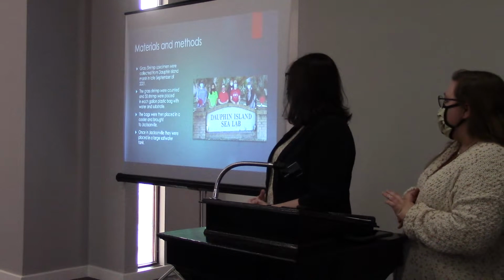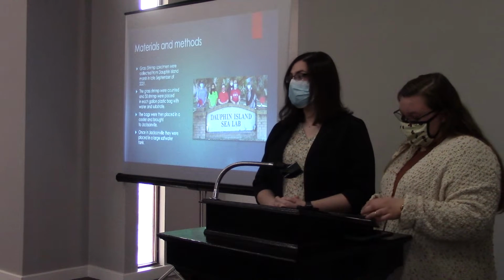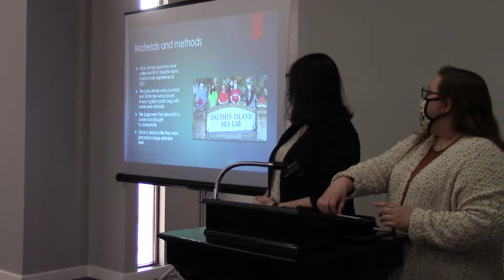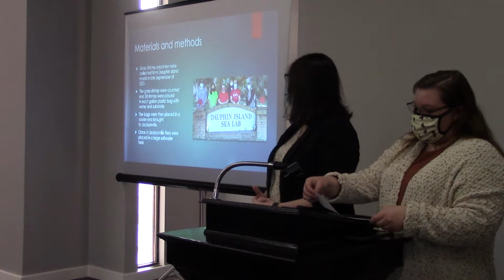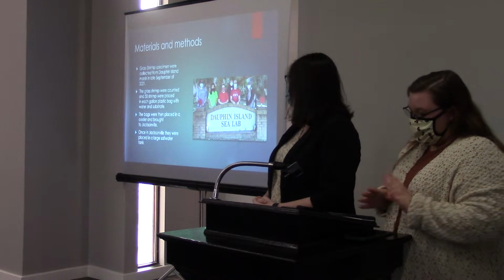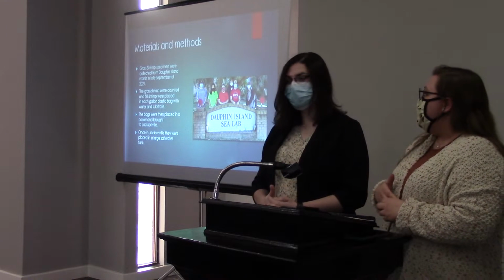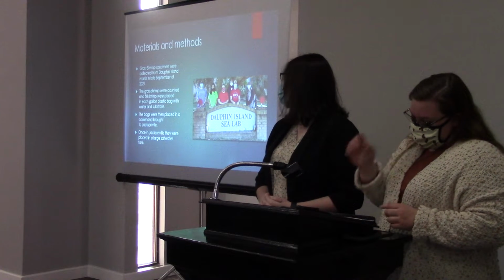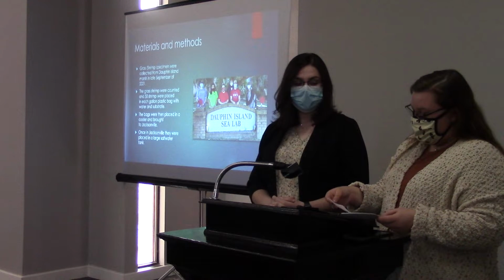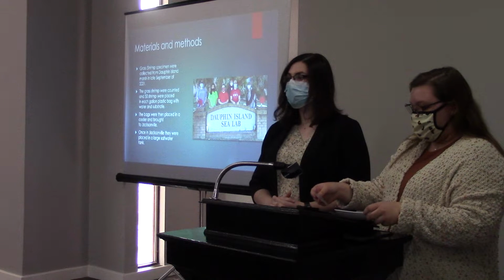To collect the grass shrimp, we took a field trip to Dauphin Island in late September of 2021. They were counted, and 50 shrimp were placed in a gallon-sized Ziploc bag with water and substrate, and then they were put in a cooler and brought back to Jacksonville. Once they were back here, they were put in a large saltwater tank, and the eggs were collected from gravid shrimp once a week and taken directly to lab when applicable, because some weeks there were no gravid shrimp.